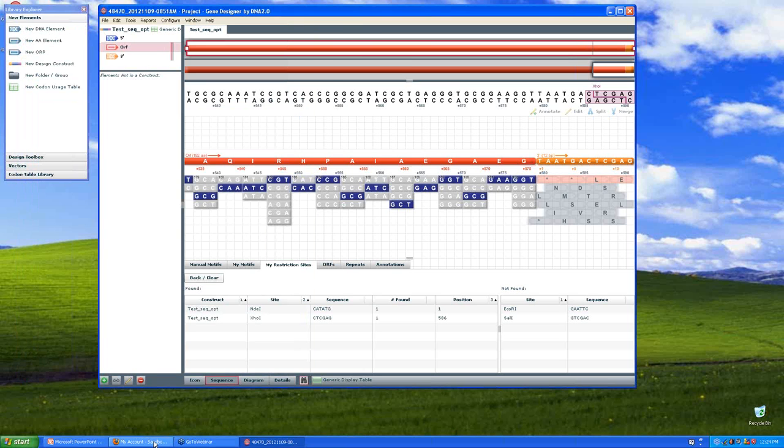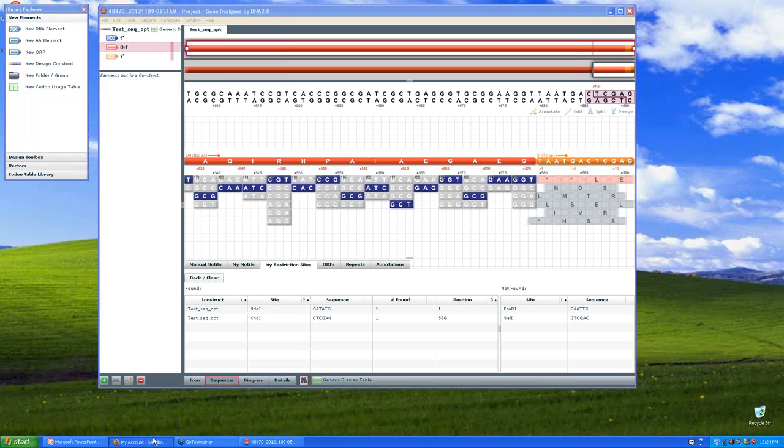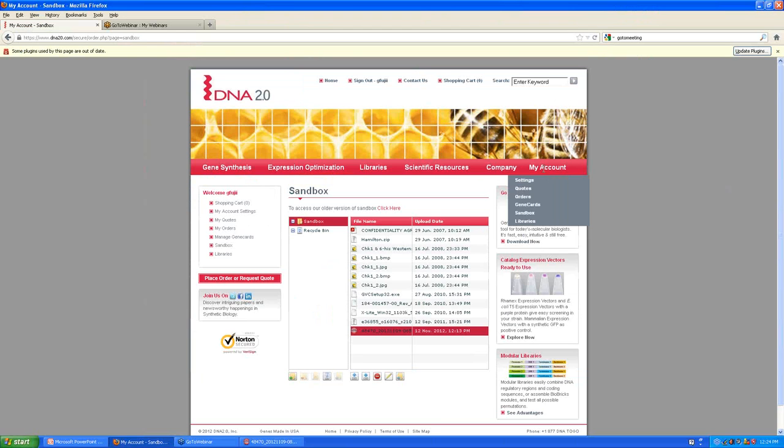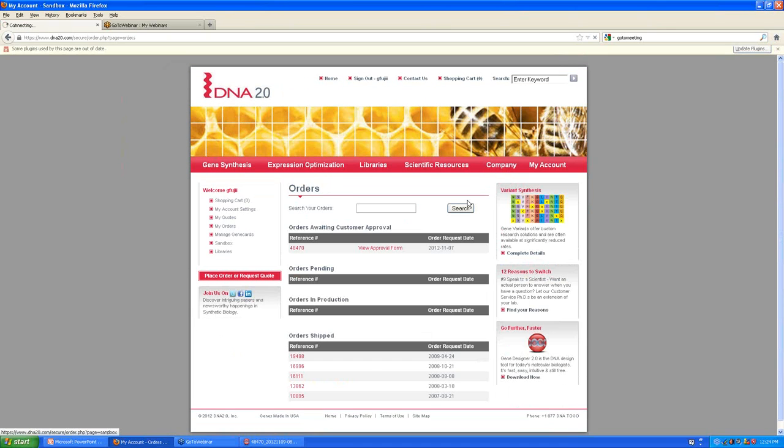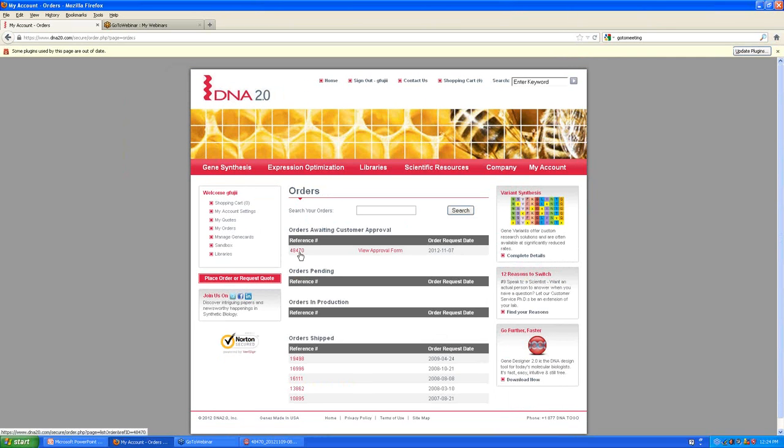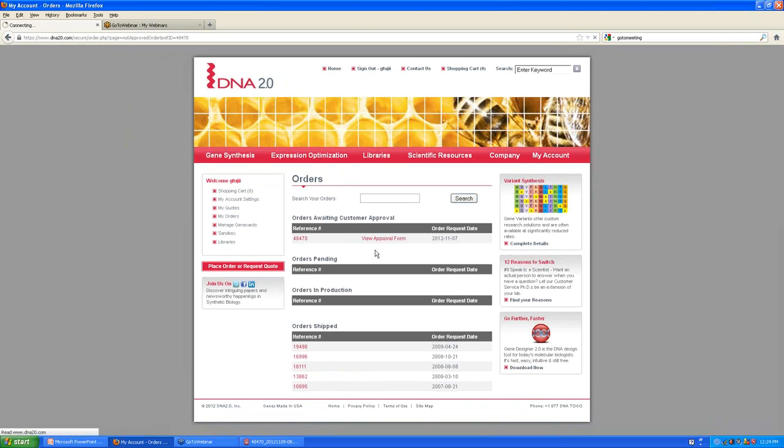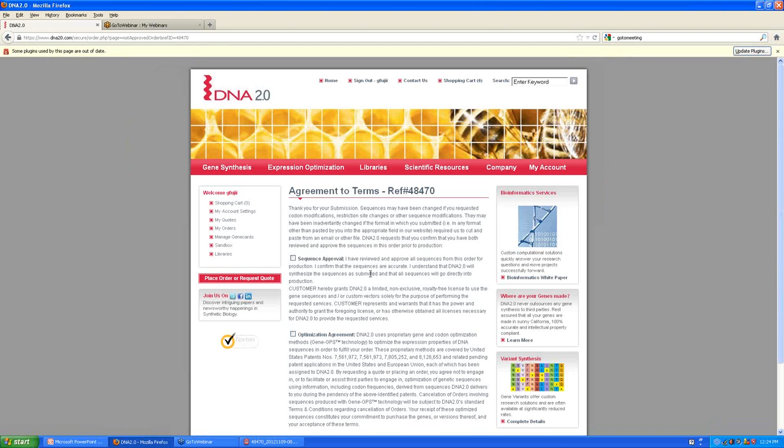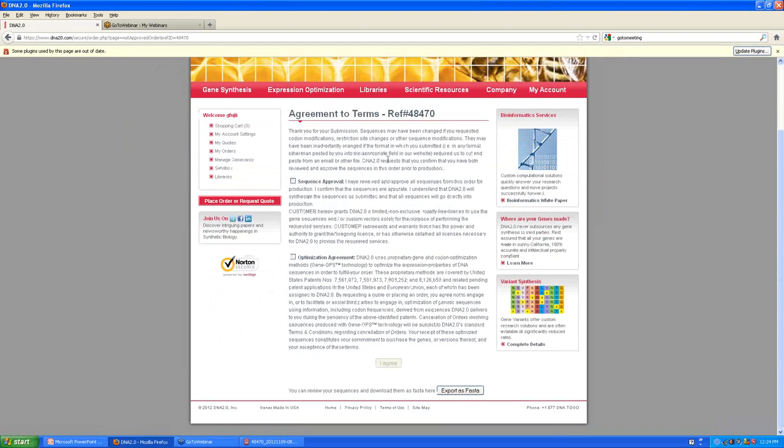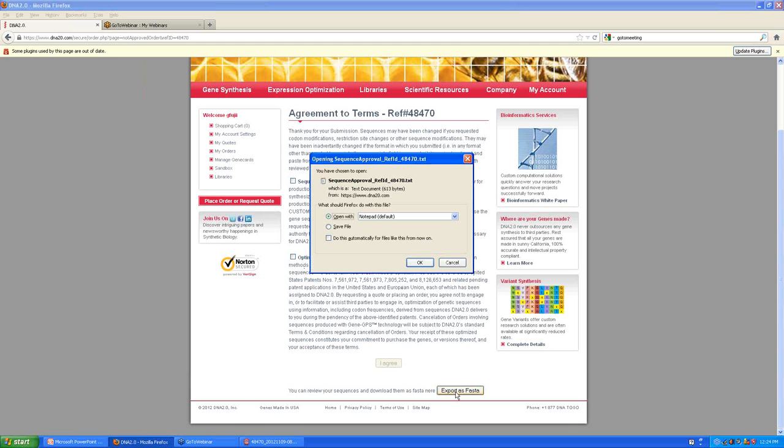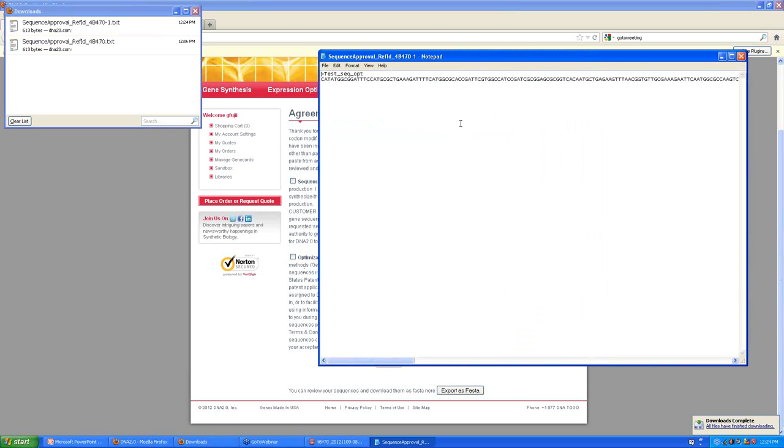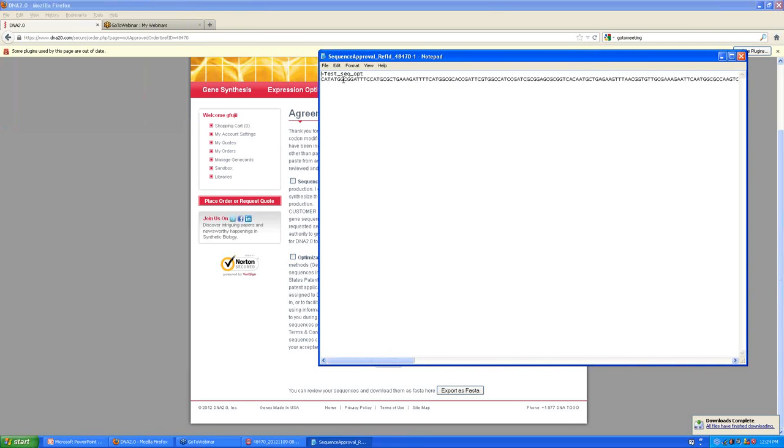And if I go to my online account, and I go to my account, my orders, and here's my order, 48470. That's in pending approval. If I click on my approval form, here are all the things that I need to approve and I read carefully. But one nice feature is that there's a button to export the sequence or sequences as a FASTA file. So again, here is my sequence, and I could certainly then use this to copy and paste and then do an alignment.